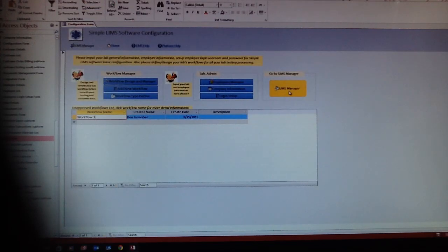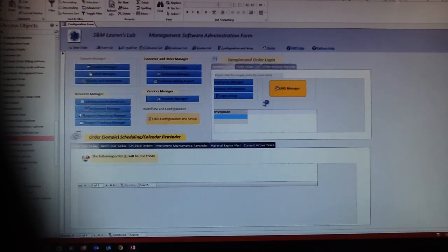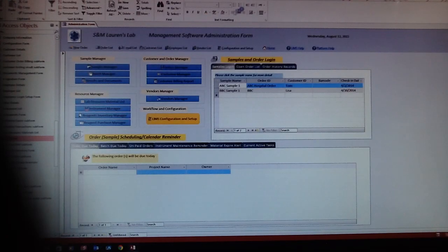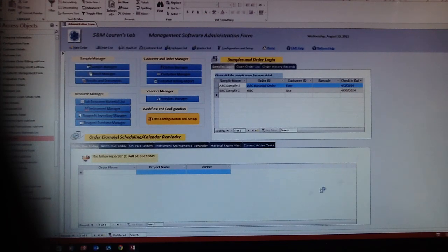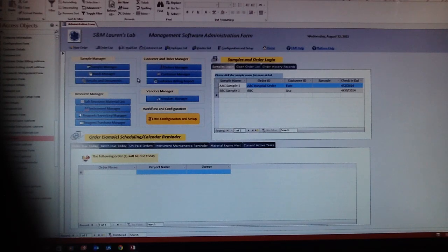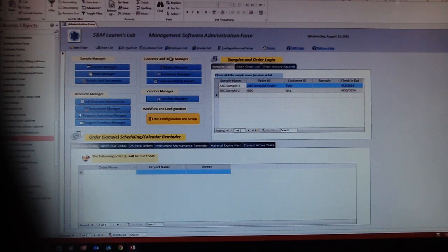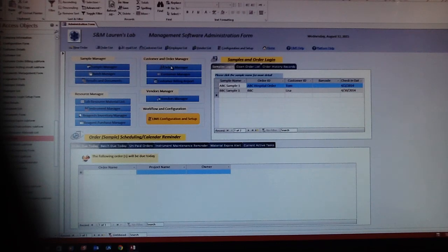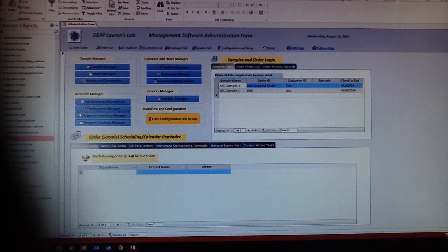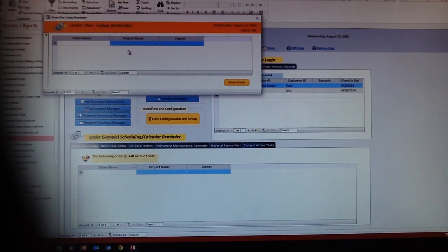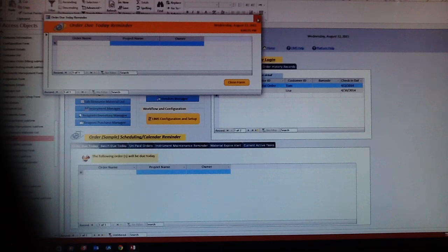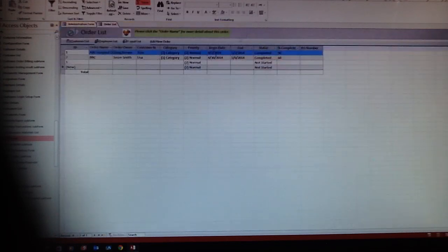After these things are done, you can go to the LIMS management and start managing your LIMS information. First, you get customers and orders, so you can start your customer order and input your order information. Here is the warning sign that says orders due today. Reminder: today you don't have any orders due, so we'll close it. Here are a couple of orders ongoing.